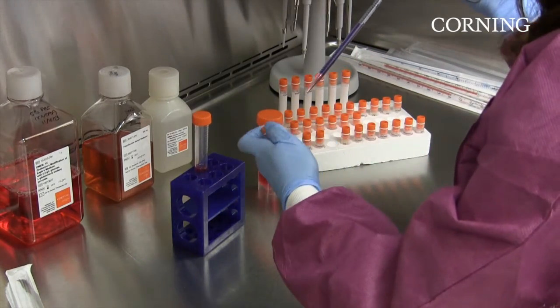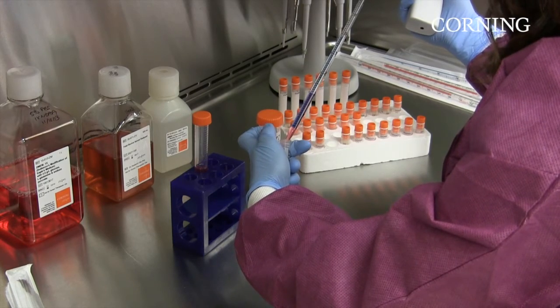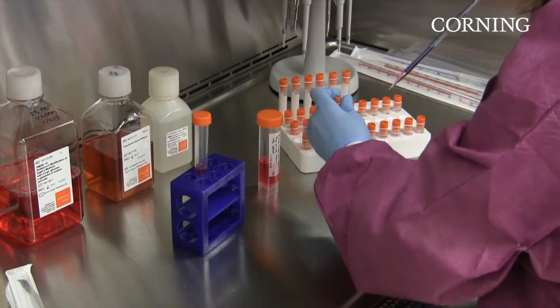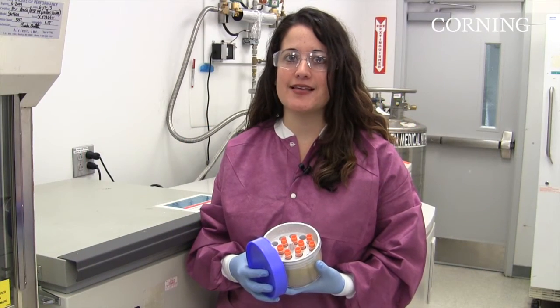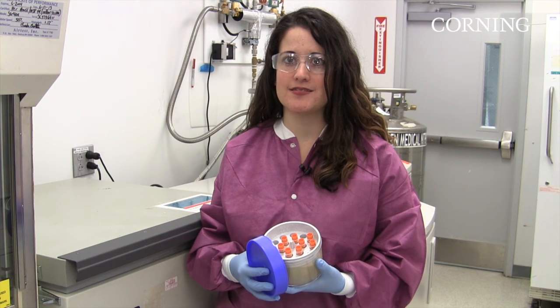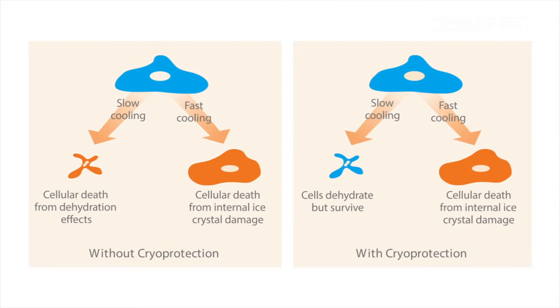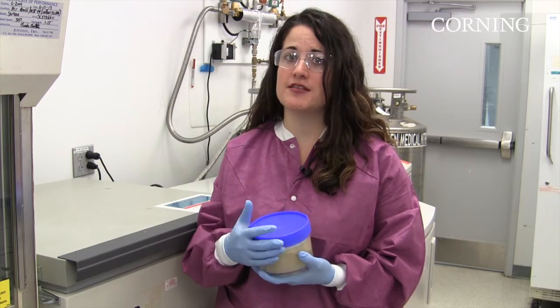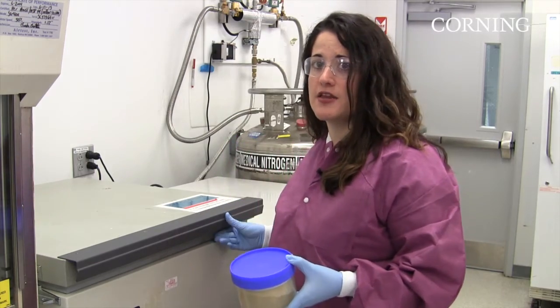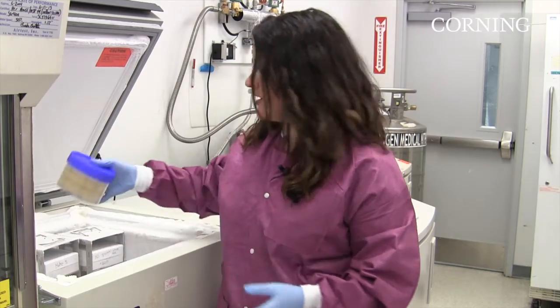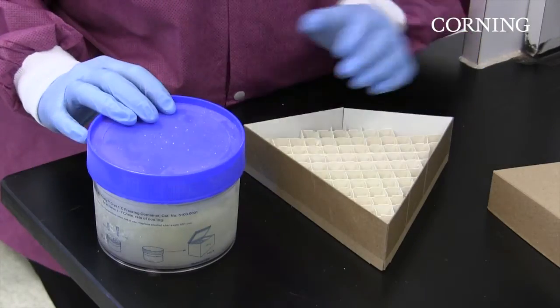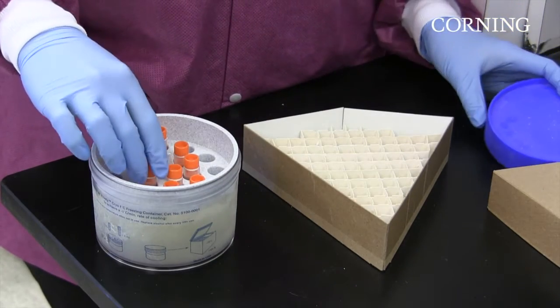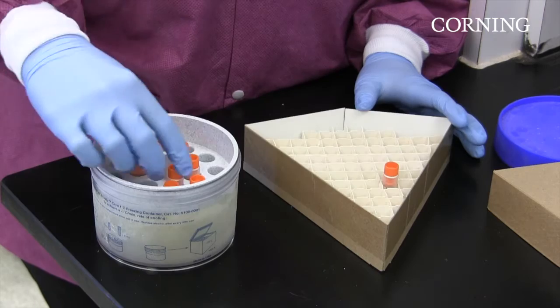Once the cells are aliquoted, I can begin the freezing process. Unlike thawing cells, the freezing process is a slow, controlled process. You want to give the cryoprotectant time to remove water from the cells, which reduces their chances of being damaged by the formation of ice crystals. I will be using a specialized container that controls the rate of freeze to 1 degree Celsius per minute. Once the cryogenic vials are in the container, they can be placed in a minus 80 freezer overnight. After 24 hours, the cryogenic vials are ready to be transferred to a liquid nitrogen freezer for long-term storage.